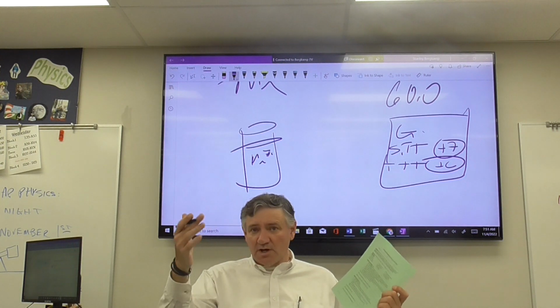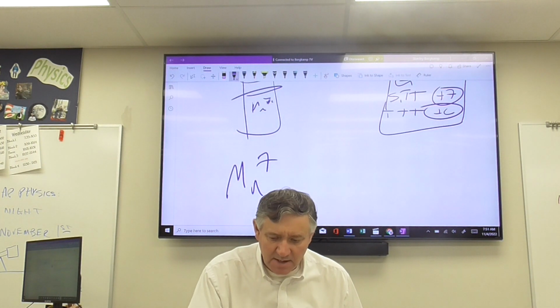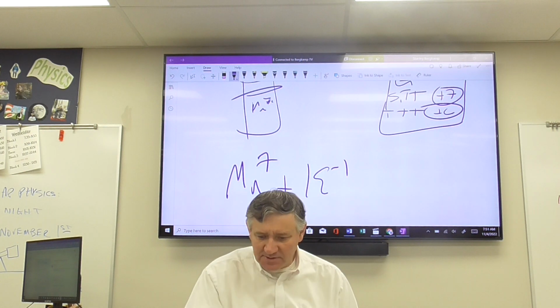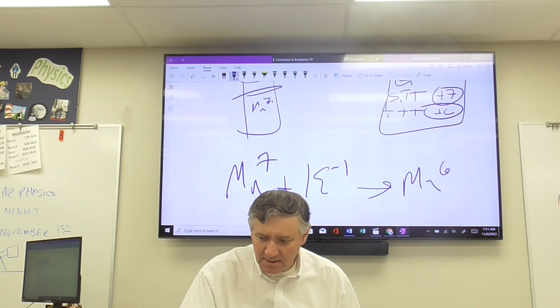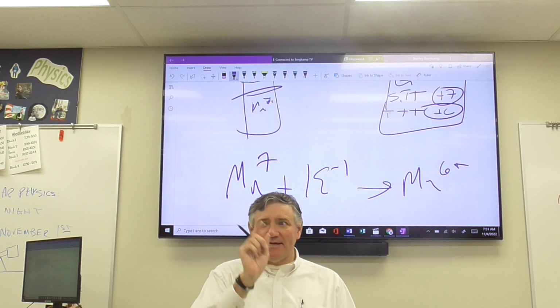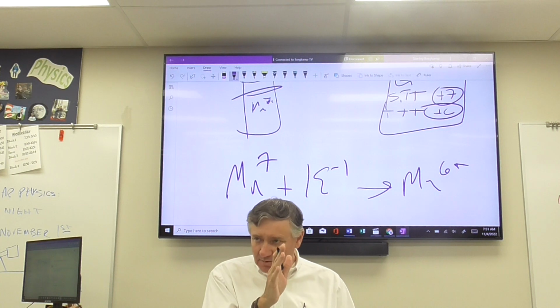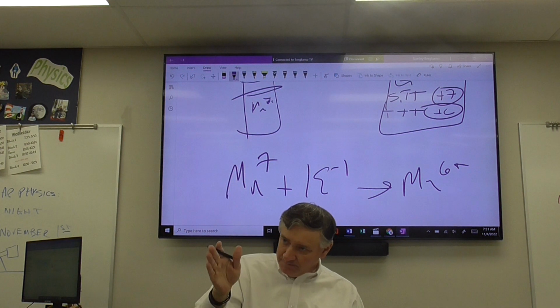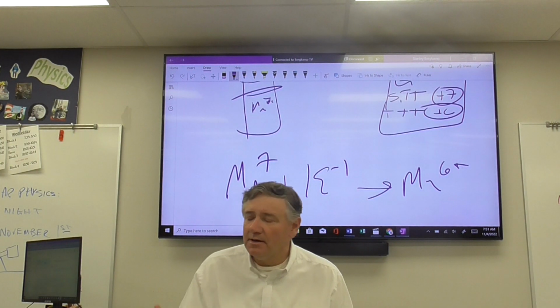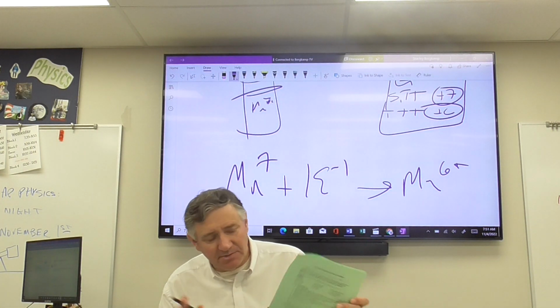So basically what we're trying to do is take Mn7+ and make it gain just 1 electron and turn into Mn6+. We're trying to get it to gain exactly 1 electron. That's why this has such small tolerances in terms of an equilibrium. Once you get that done, hopefully it turns green. That's the sketchiest one. Should be okay.